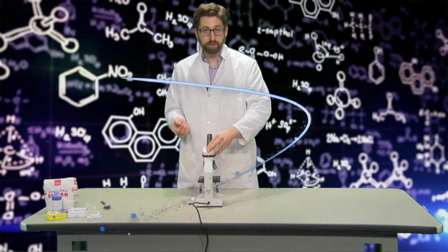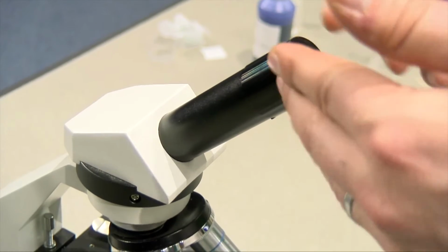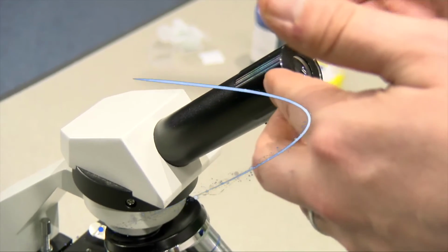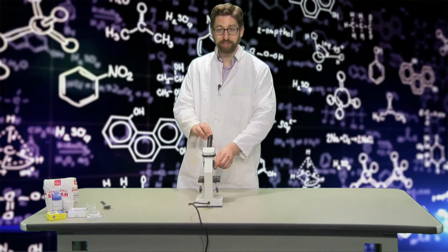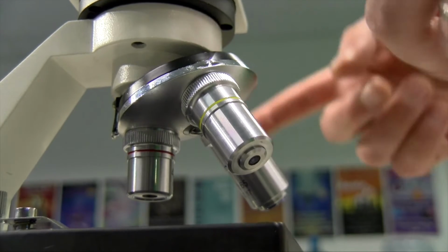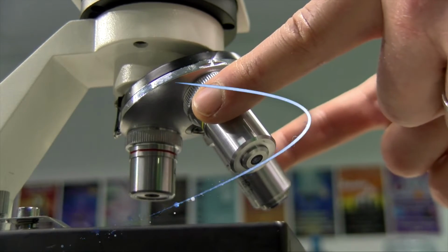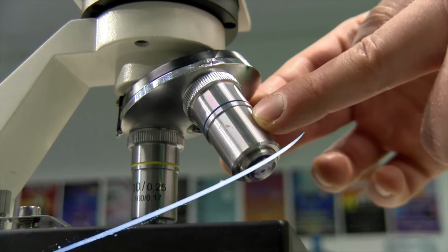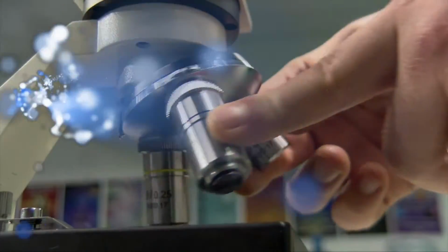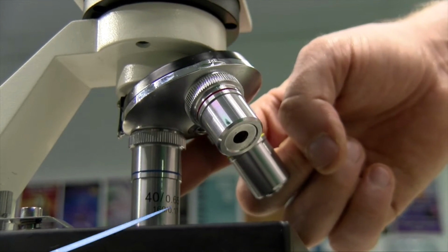Now, here are the parts of the microscope. First up here, you have the eyepiece. Every compound light microscope, and that's what this is, has an eyepiece and objective lenses. And you can actually see there are 3 objective lenses. I have a red one, that's my low power, my 4 times lens. I have my yellow, my medium power, my 10 times lens, and then I have a blue. That's my high power, my 40 times lens. Those are how many times it magnifies what I'm able to do with just my eyes.